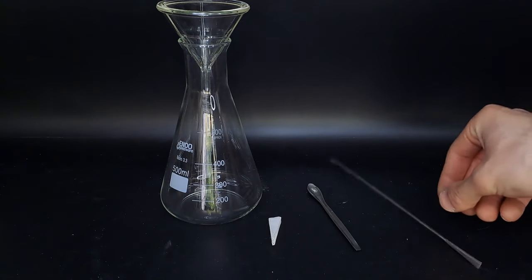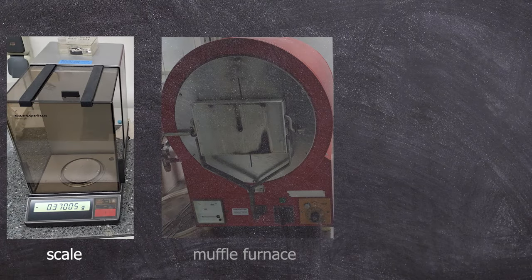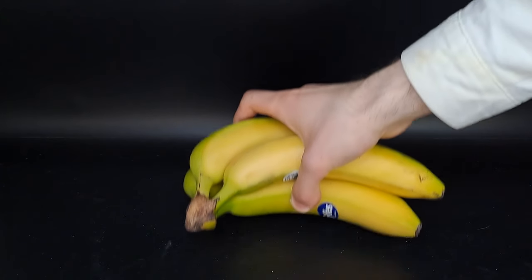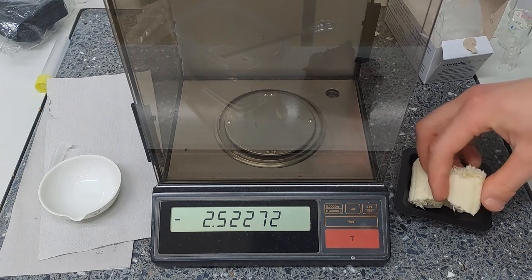As for equipment, we'll need some filtering tools, spoons, spatulas, a scale, and a muffle furnace. A gamma detector and a hot plate could also be useful. In terms of chemicals, we'll just need four bananas.